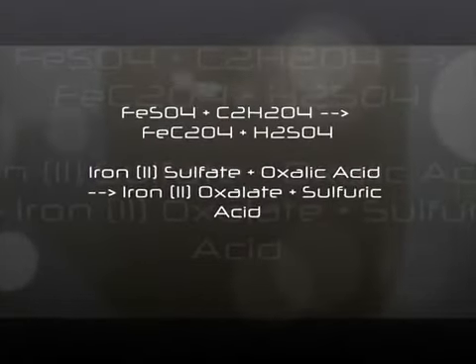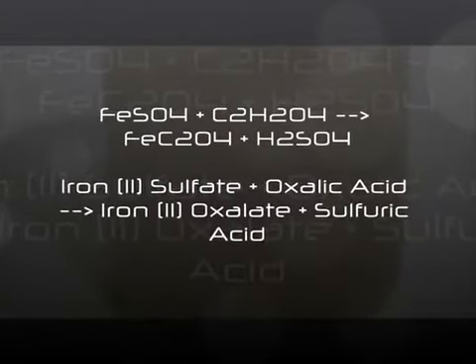Here's the reaction: the iron sulfate is reacting with the oxalic acid to produce iron oxalate and sulfuric acid. This precipitates out to form a yellow compound somewhat like mustard — this is actually the iron oxalate. It's very beautiful.